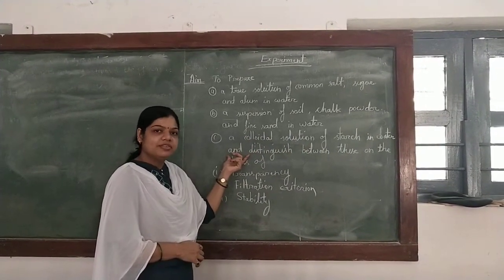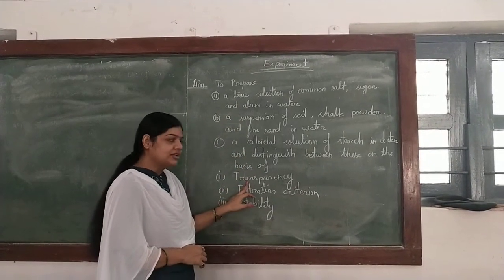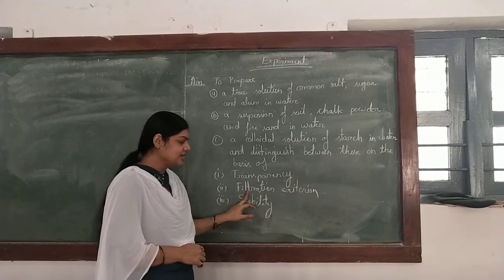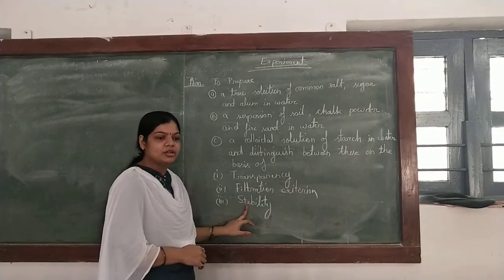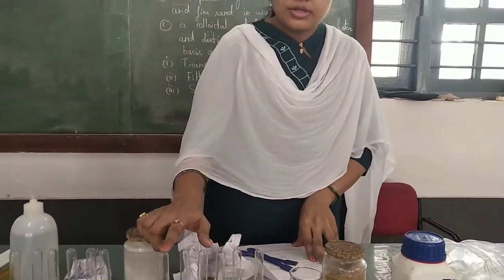And we will differentiate the three different types of solution on the basis of their transparency, their filtration criteria and the last is stability. So look at here, we are having some chemicals. We require some test tubes for the experiment.